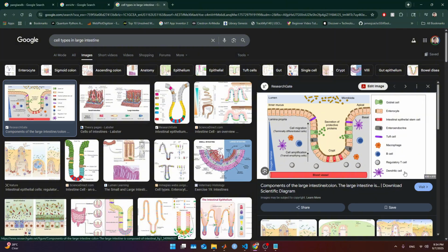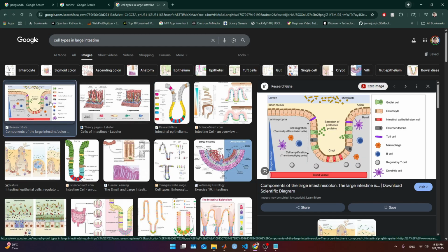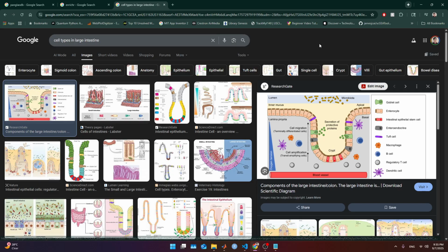Mostly these cell types, I've seen in colon tissue, specifically in mice, although we are working with human. This is another one. Here they have goblet cells, TA cells, transit amplifying, enteroendocrine, enterocyte absorptive. Here are already some specialized or sub-cell types of colonocytes. And potentially we are going to find those.